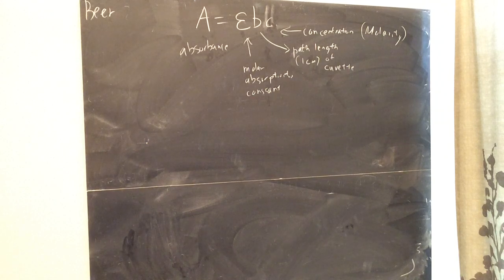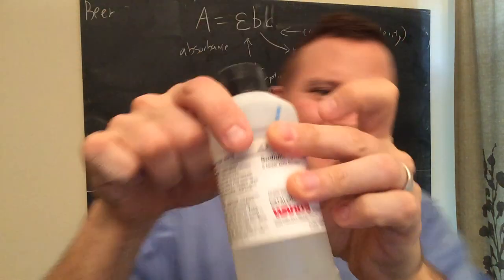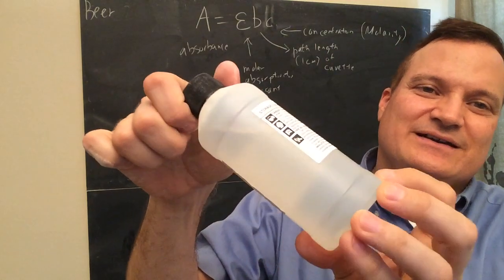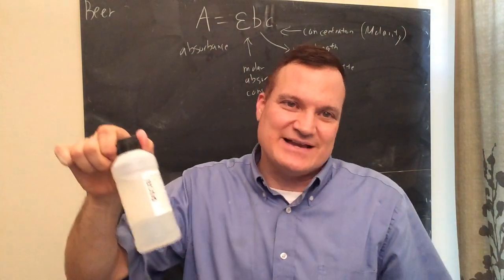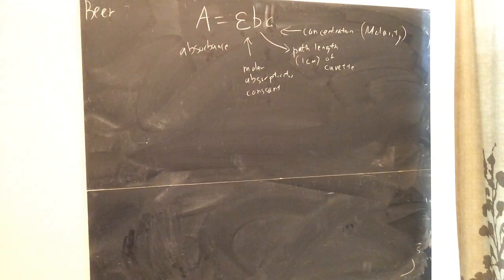Well, there aren't as many as there are. Most chemicals look like this. What is that? Wait a minute, it's sodium hydroxide. But look, it looks just like water, just like salt water. So almost every chemical you dissolve in water has no color. Well, anyway, but some do have a color.